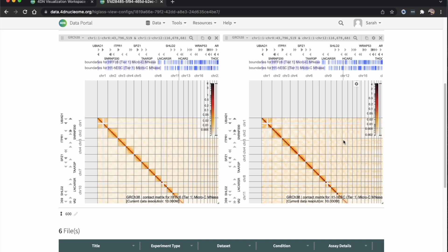Now the contact matrices are next to each other, and above each contact matrices are both 1D tracks.